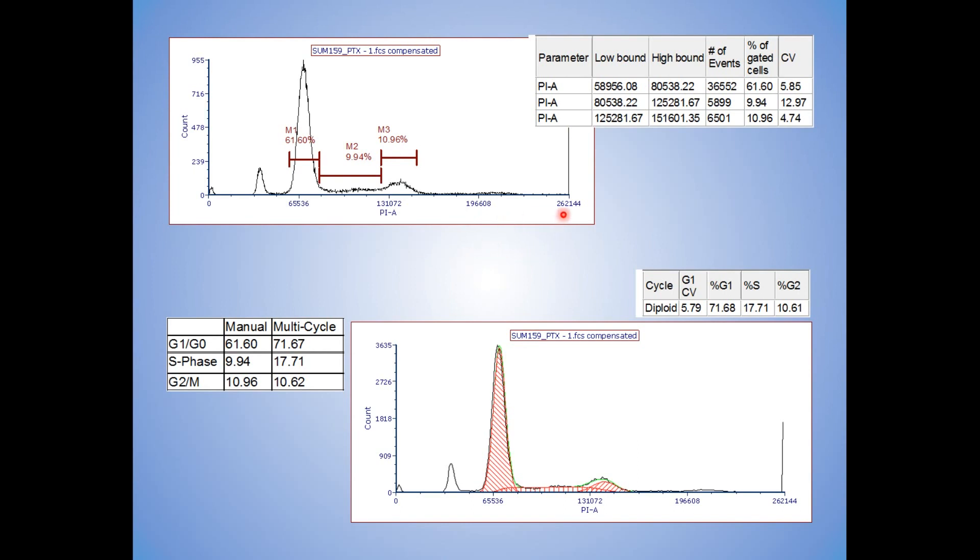Now, here's the first nail in the coffin as to why you should not be doing region analysis. Here is region analysis done on this file. And I take the same file. I put it through FCS Express Multicycle and let it generate the data. And I summarize it over here.